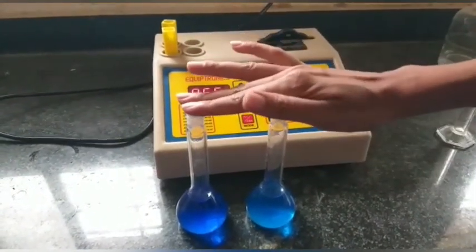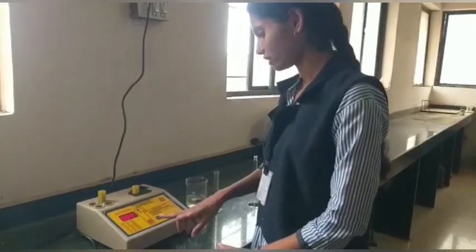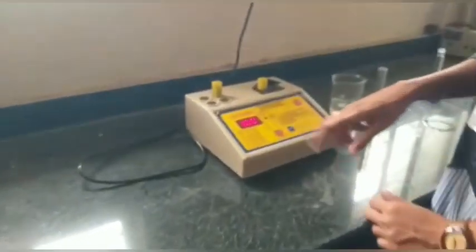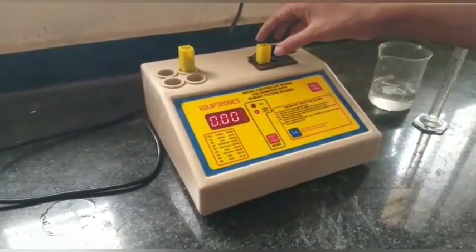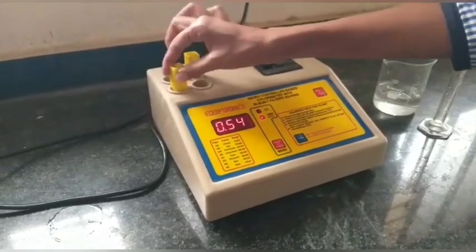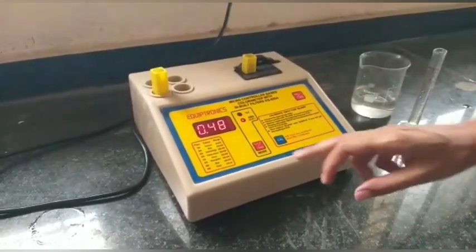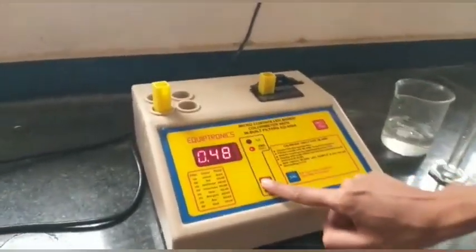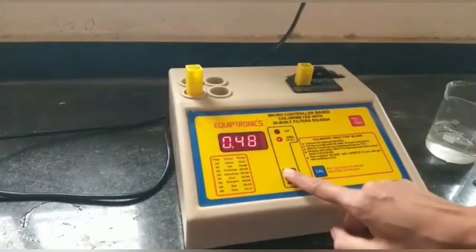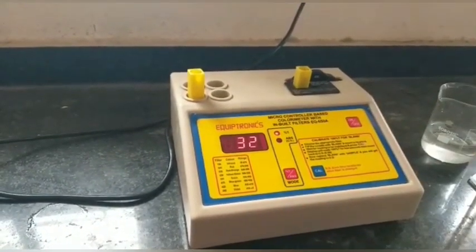For distilled water, we can see transmittance at 100 and absorbance at 0.00. Now for higher level, absorbance shows 0.48 at 620 nanometers and transmittance at 33. For lower absorbance, the lower solution shows 0.15.